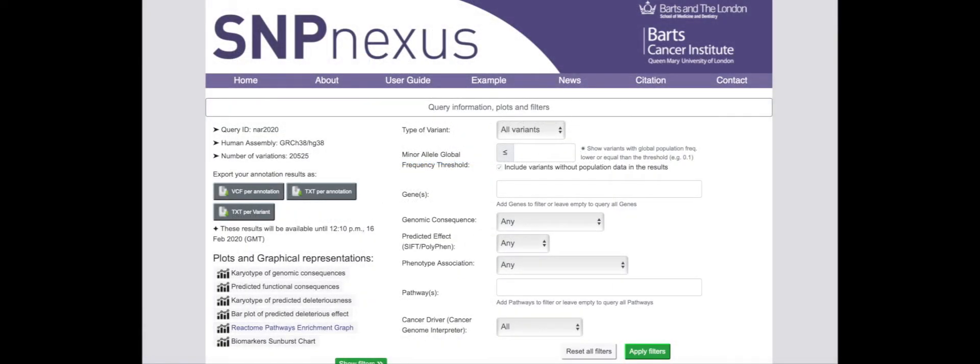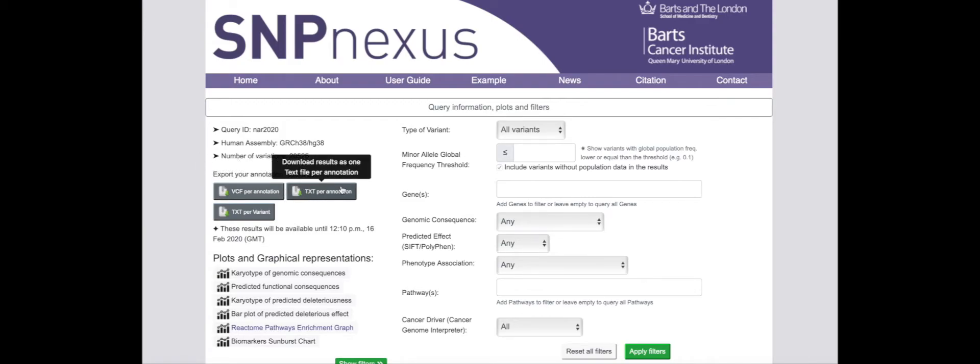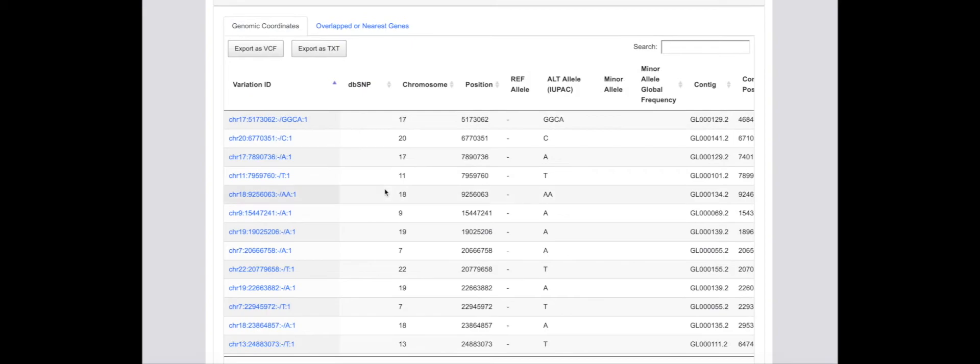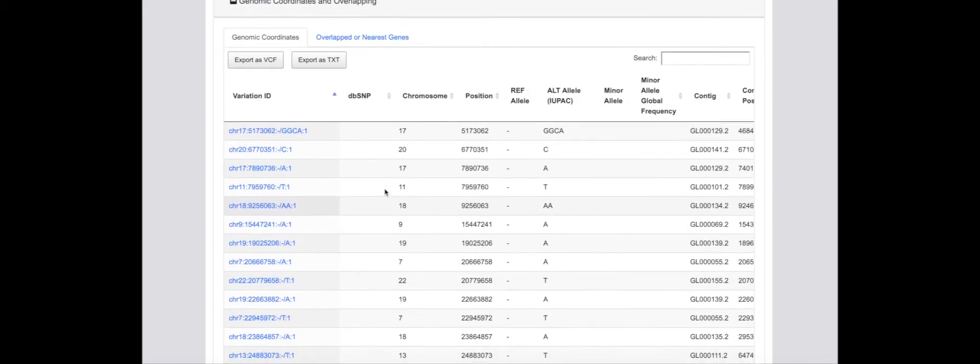Once the annotation process is complete, the results can be downloaded in either VCF or text format, or explored and analyzed using the interactive tables and plots provided.